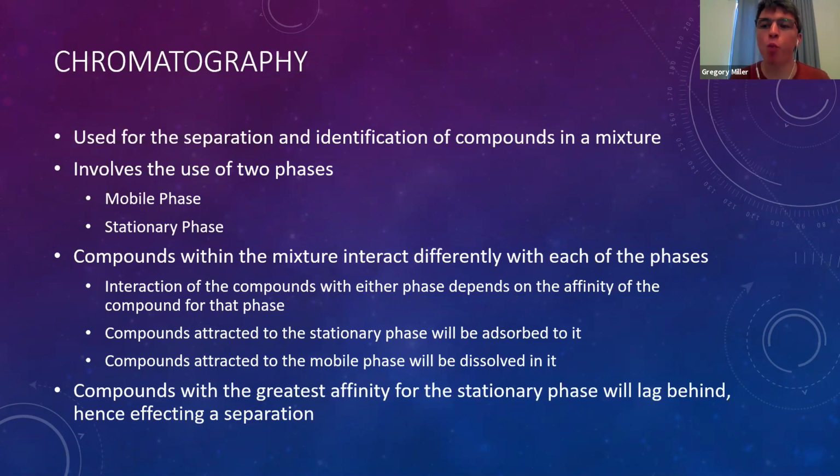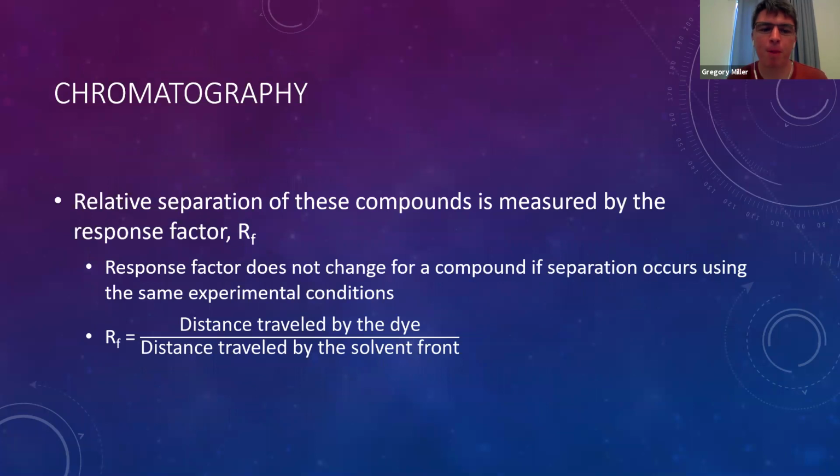Now, all compounds will interact with both pieces to different degrees, and that's how we get our separation. So something that interacts with the mobile phase more than the other will move further along, but both will move because they both eventually will interact with your mobile phase.